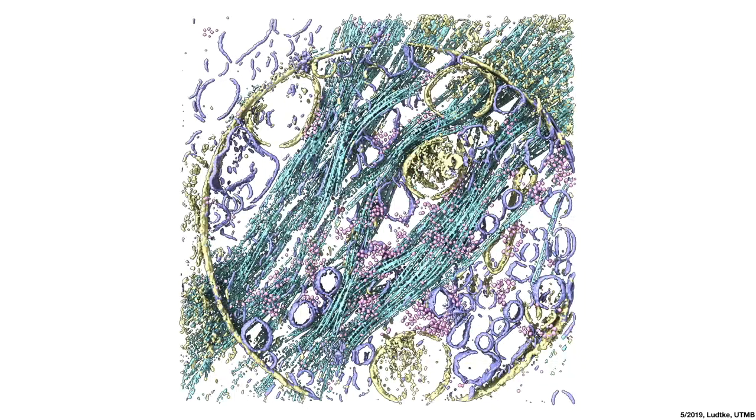It's not clear that you want to use this at the level of differentiating between two objects of a similar size and shape. You're not going to differentiate between a ribosome that has a substrate and a ribosome that doesn't. You might be able to, but that's probably not the right level to approach this tool. This tool is used for doing a coarse segmentation of the tomogram into different objects of similar shape and size. Once you've done that, you move to subtomogram averaging and classification, where you can do discrete classification of the things you found that are similar into different groups.